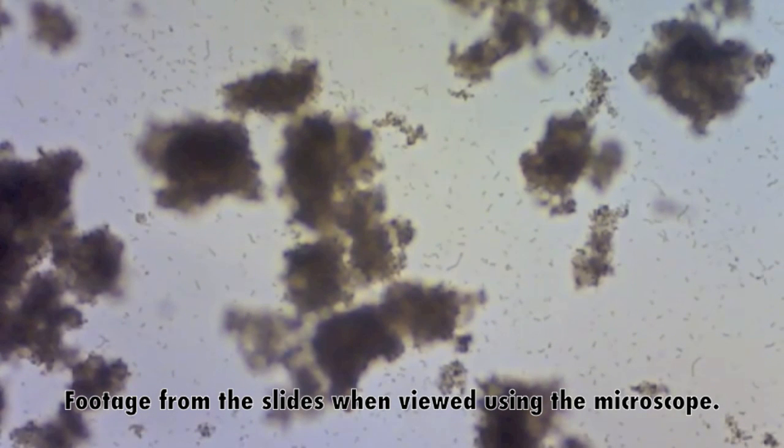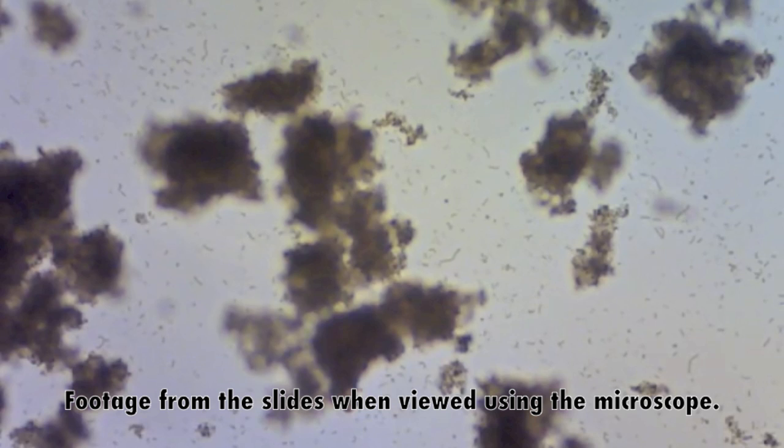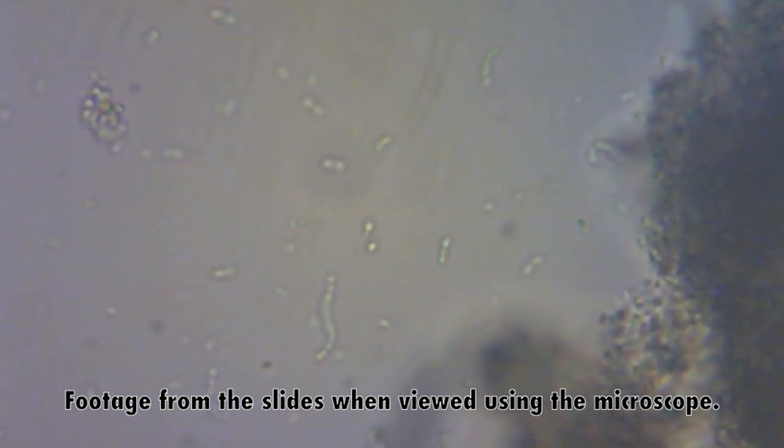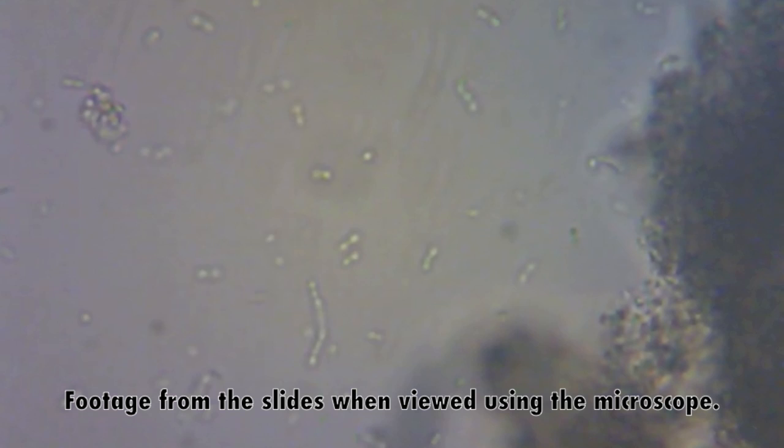Here is some footage I took while looking at my slides. This is medium strength under my microscope. These two are taken under the highest setting of my microscope.